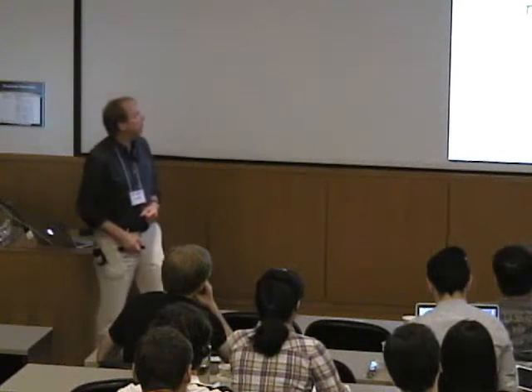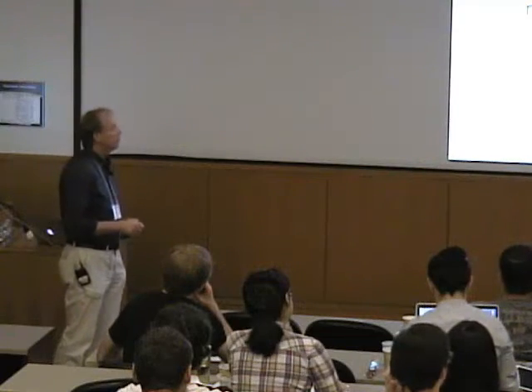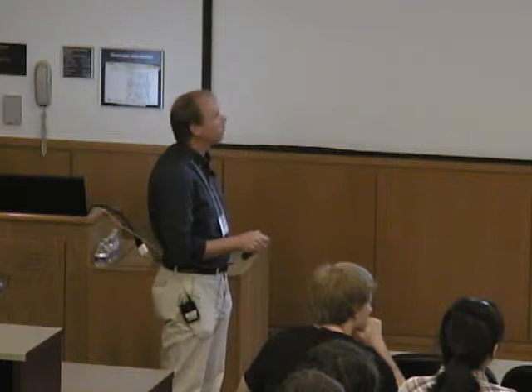Okay, so this is a picture of a typical X-band EPR spectrometer. The fact that we're using a resonator has a really important consequence for how we do the experiment. Right? So the question is, can we now sweep the frequency, sit in resonance with our resonator, and then change the frequency and find the frequencies where the sample absorbs? And so if we look at an effective resonator, it will have a range. The width of the bottom of the dip will be somewhere on the order of 1 to 10 megahertz. Right?